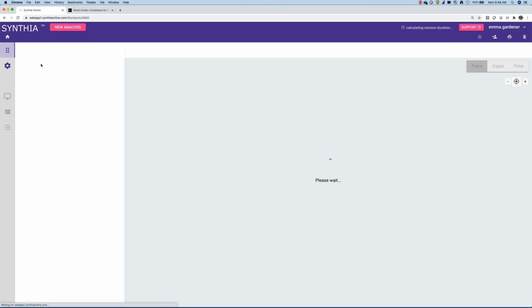I apologize, sometimes it just has to get refreshed quickly while I've got a search running.